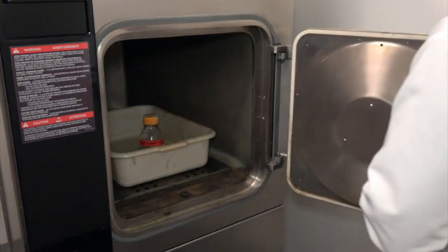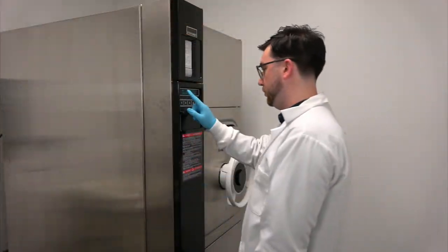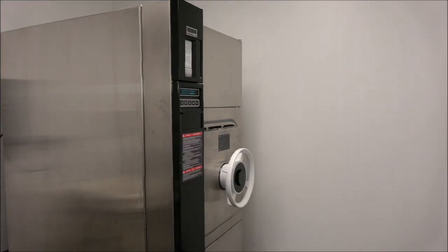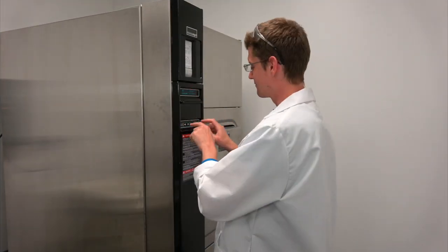To begin, we place our LB agar colloid in the autoclave and seal the door. We then set the autoclave to reach 121 degrees Celsius under 20 psi for 20 minutes and start the autoclave cycle. Do not use the autoclaves if you have not been properly trained.